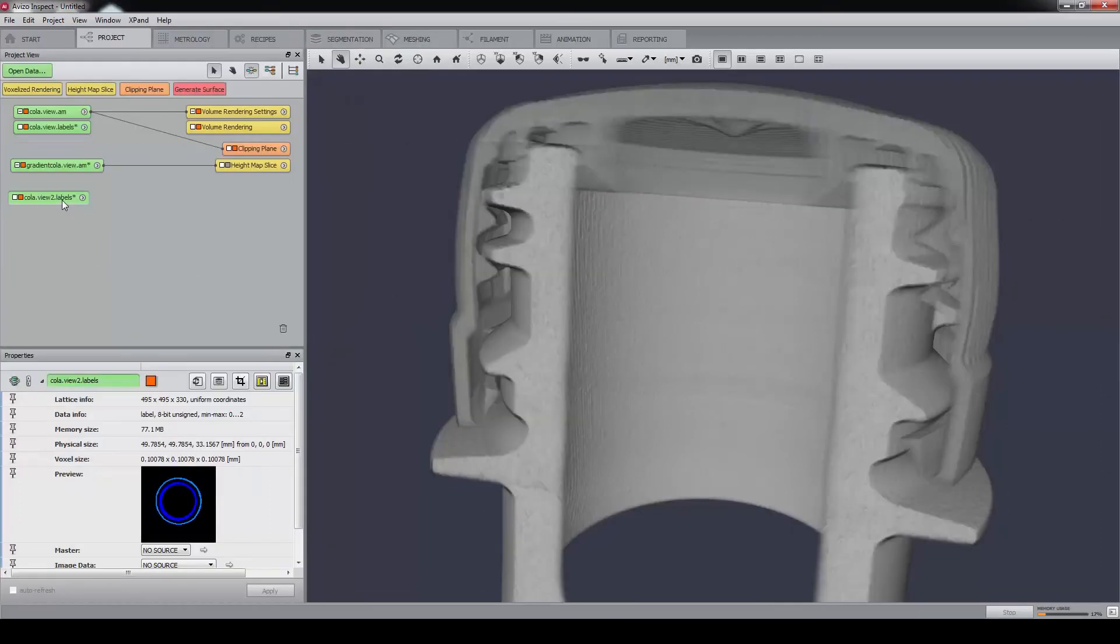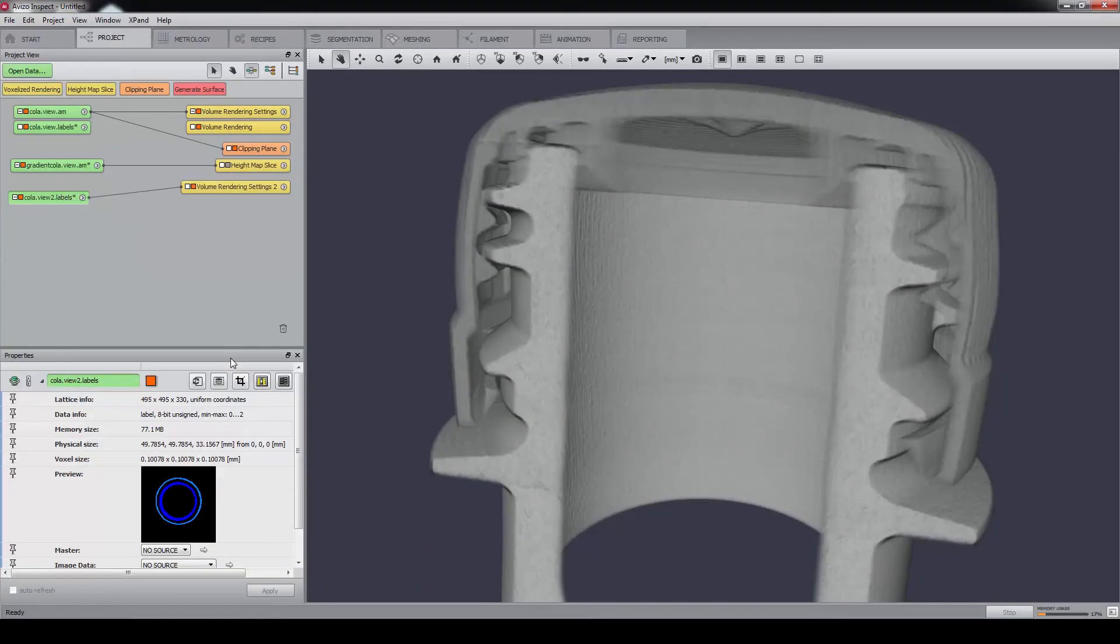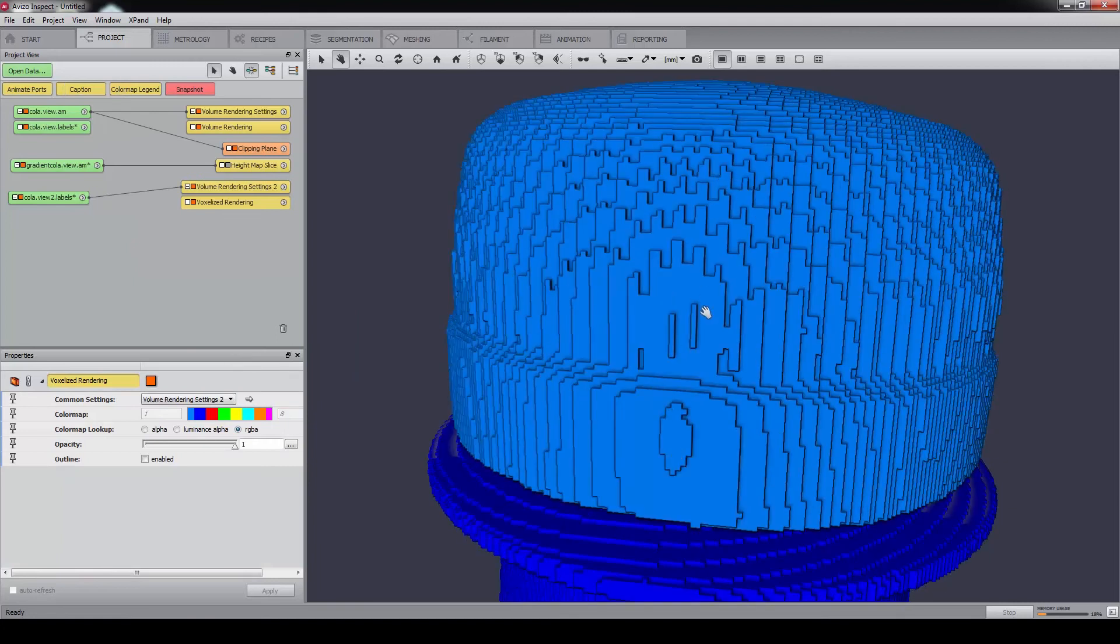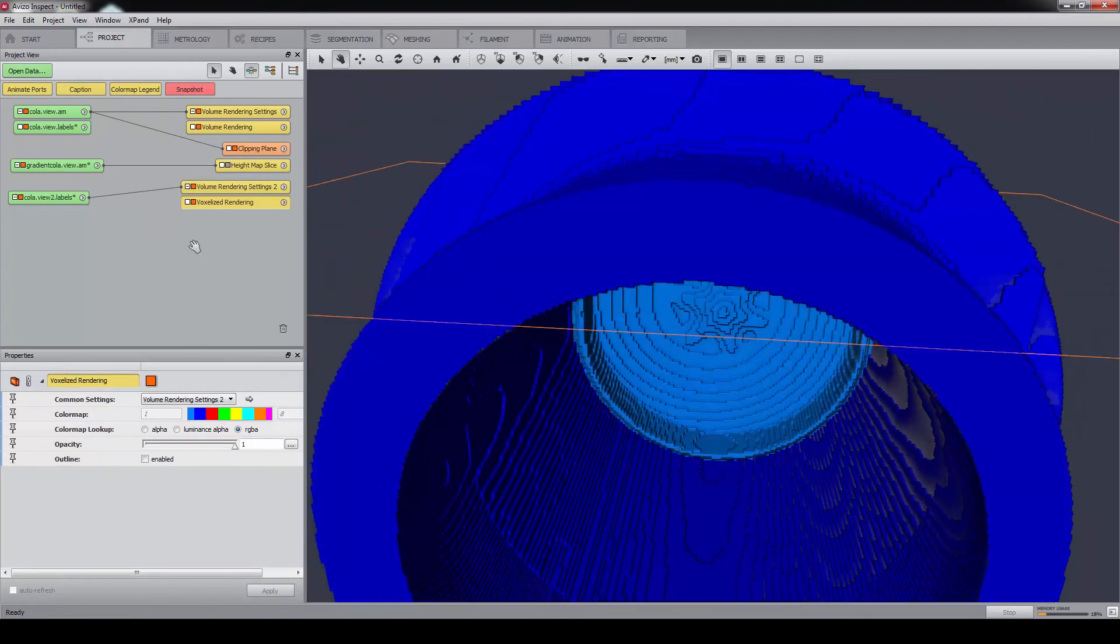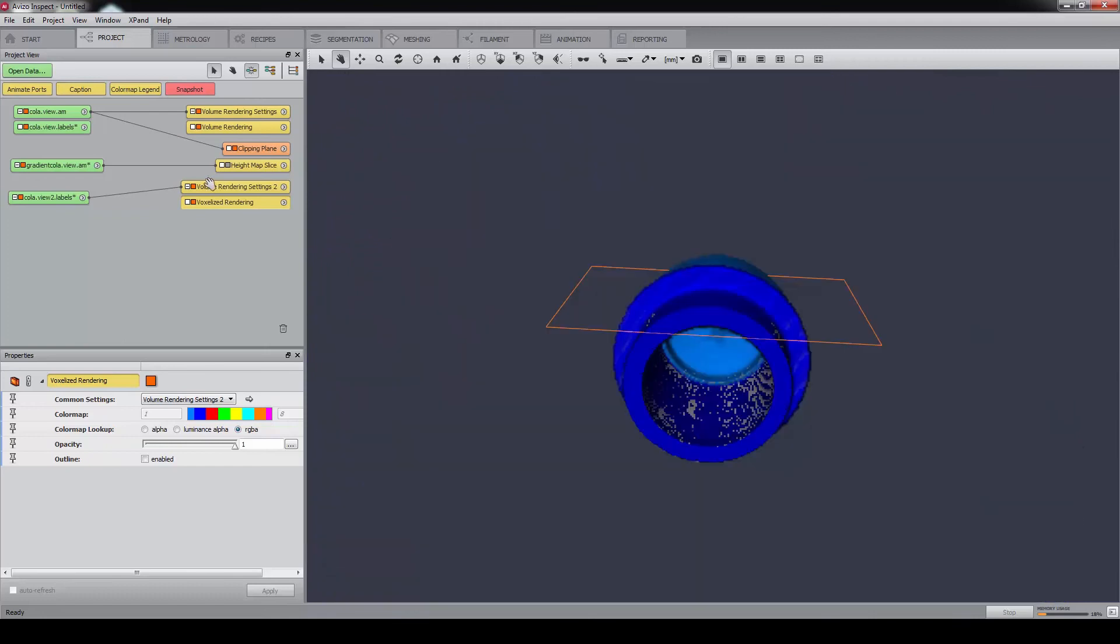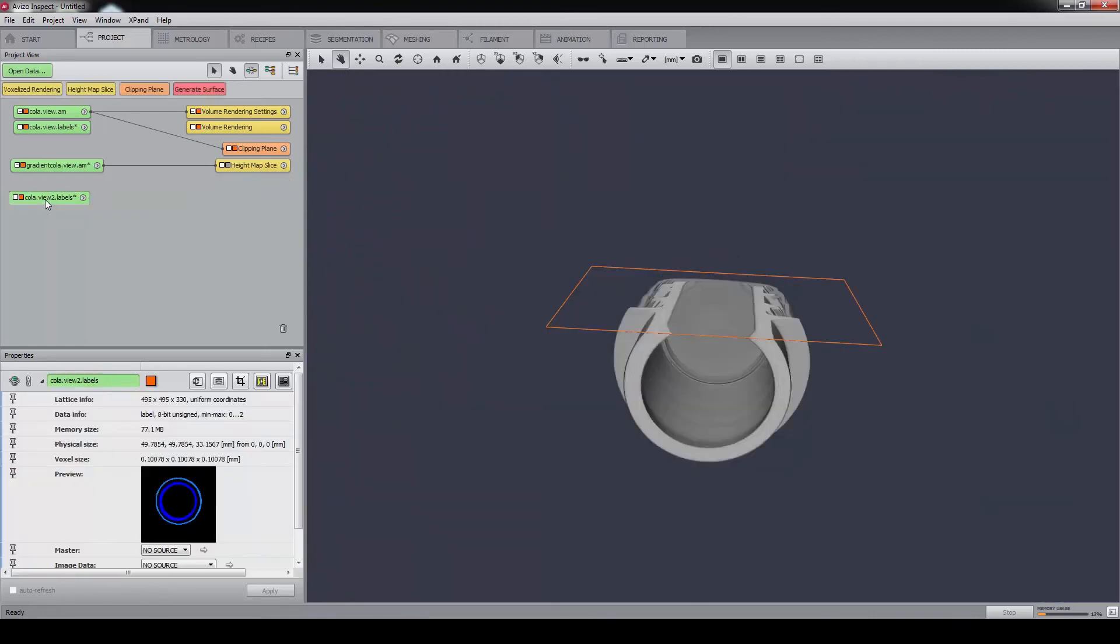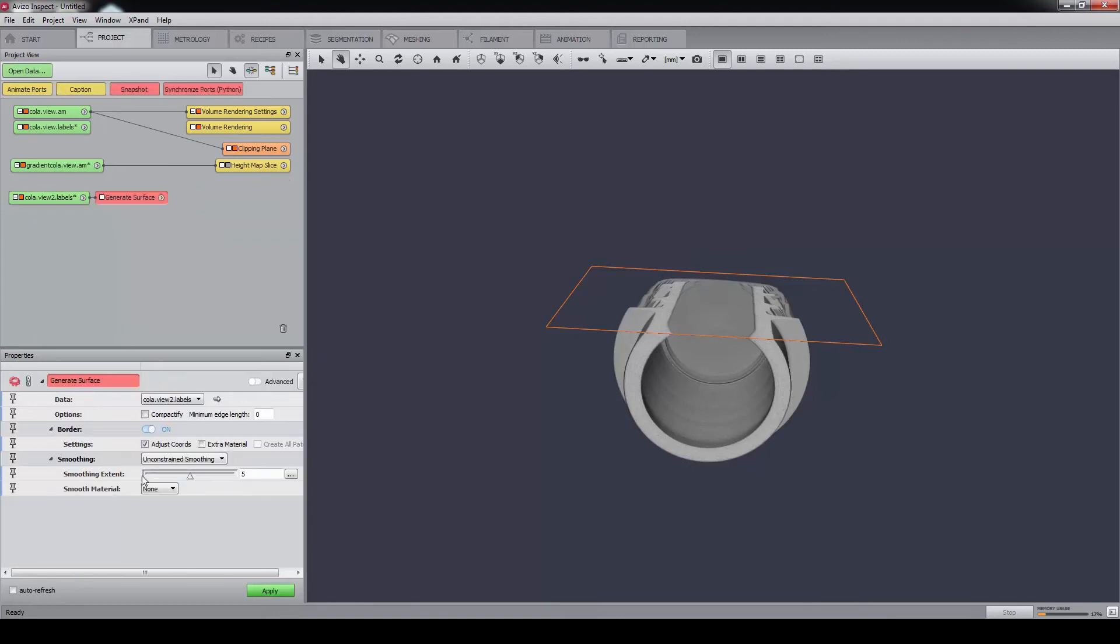We can visualize it with a voxelized rendering. We can also triangulate the surface with the generate surface module. We lower a little bit the degree of smoothing.